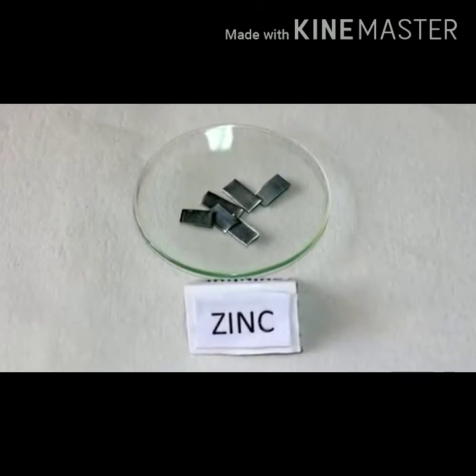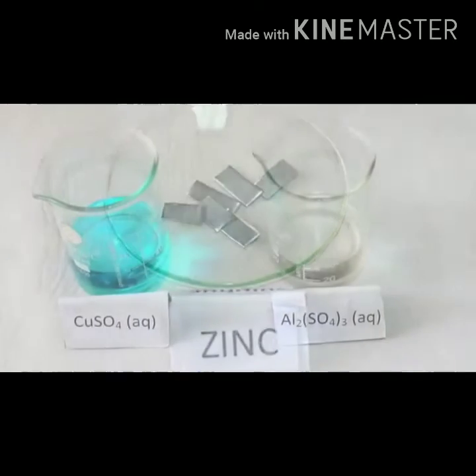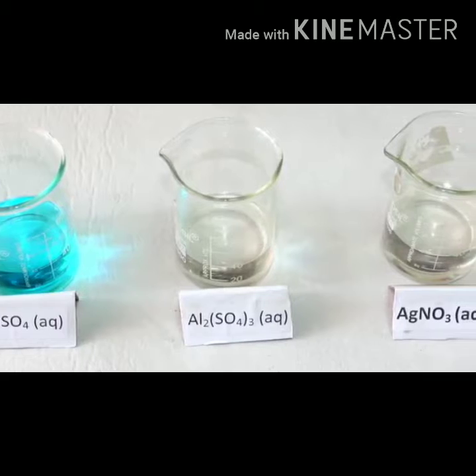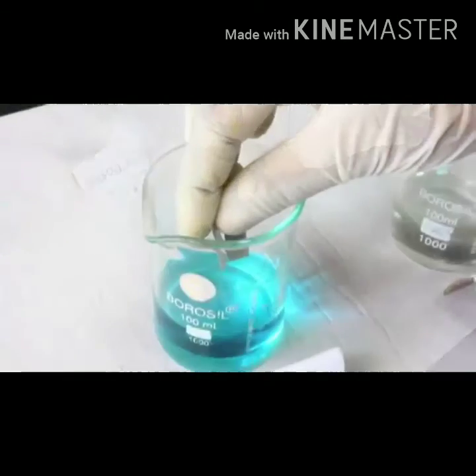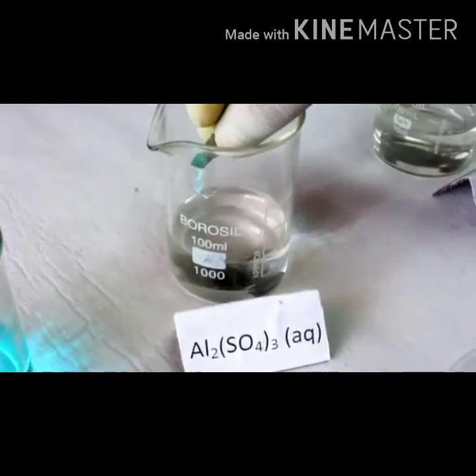To test the reactivity of zinc in the solutions of copper sulfate, aluminium sulfate and silver nitrate, take small pieces of zinc and add them in the beakers containing these salt solutions.